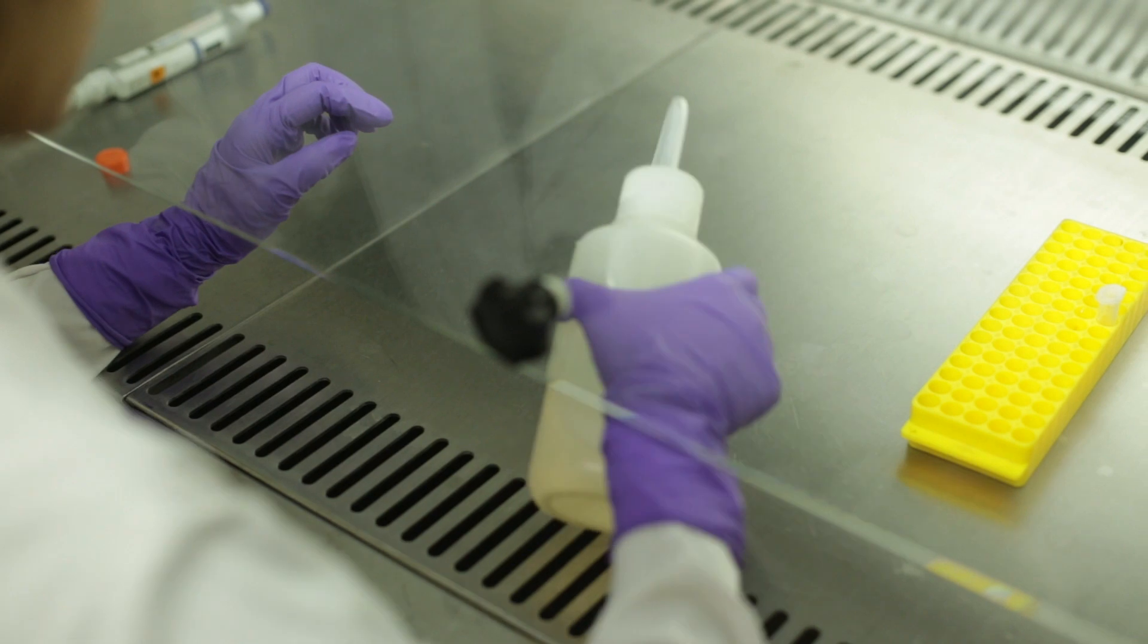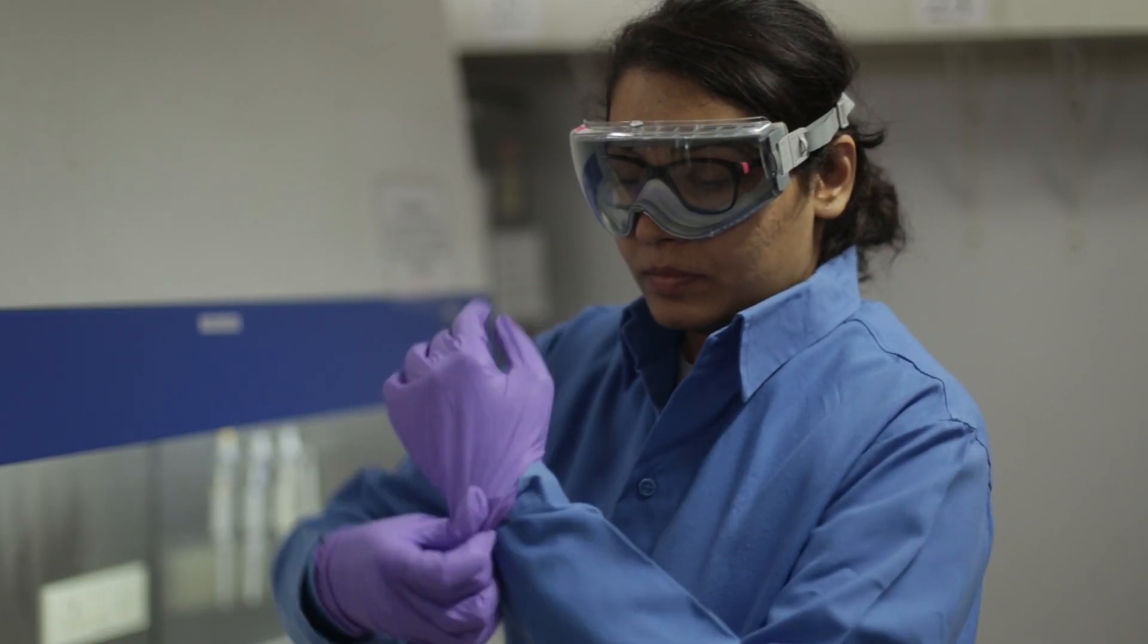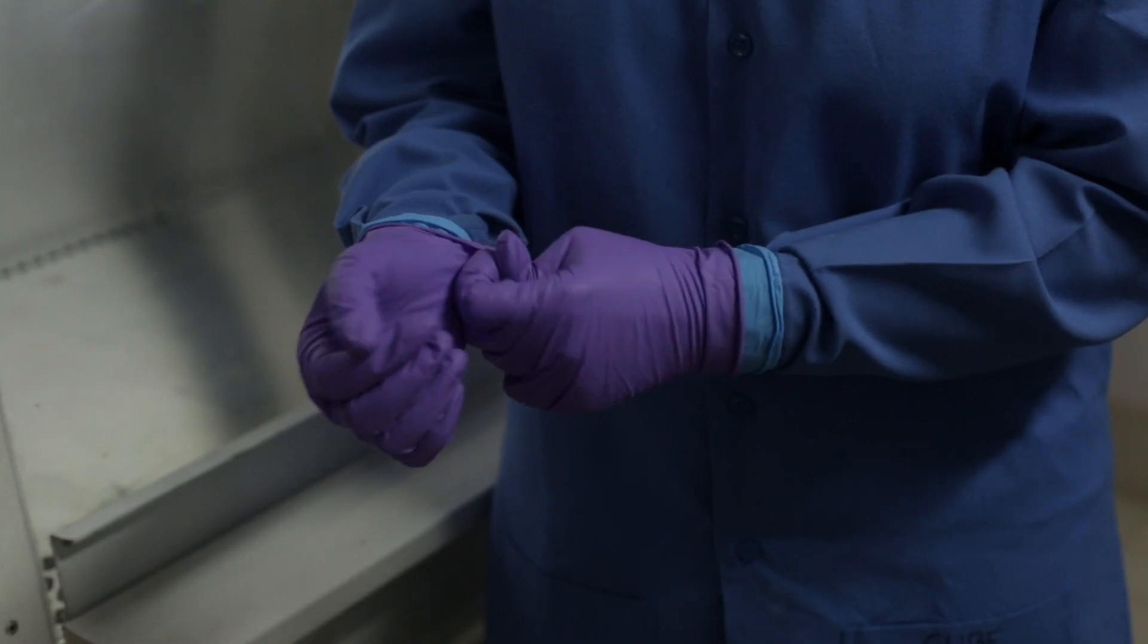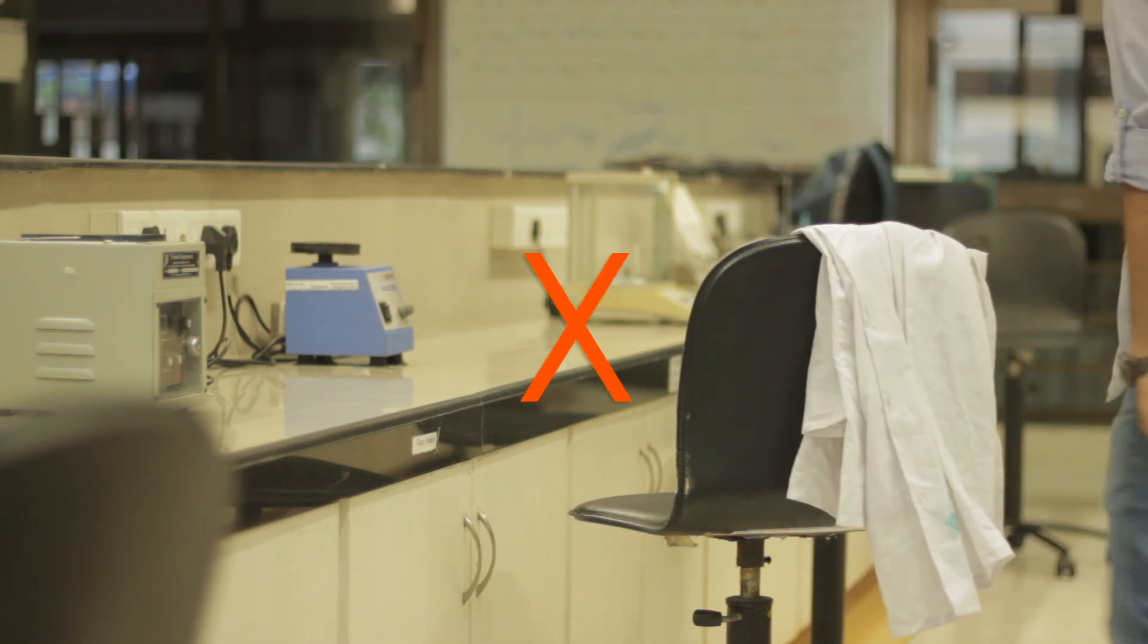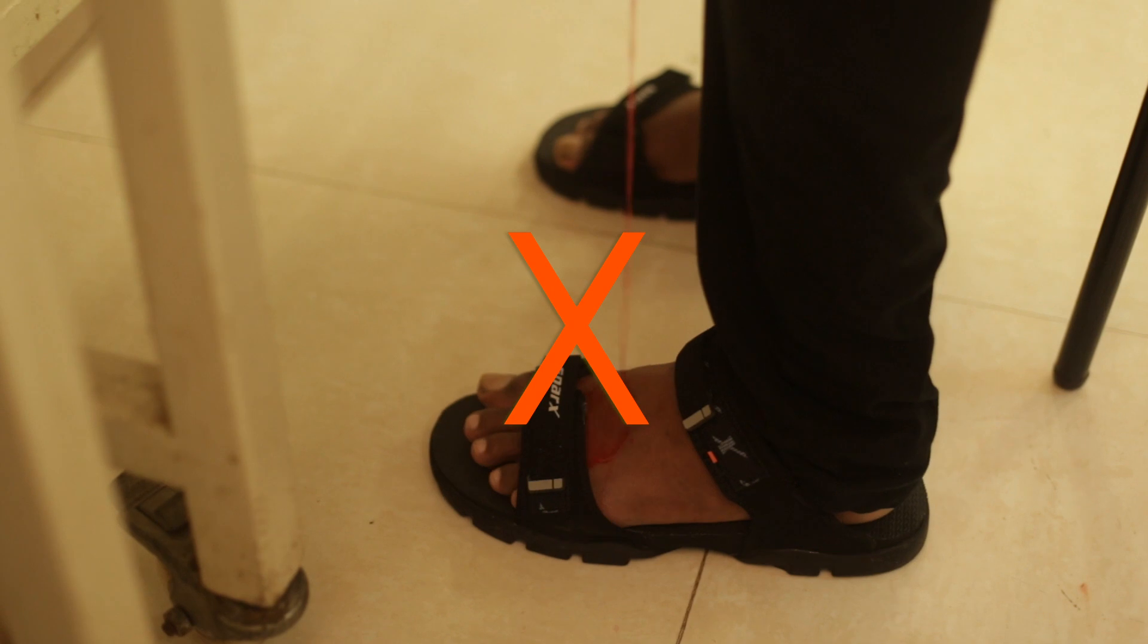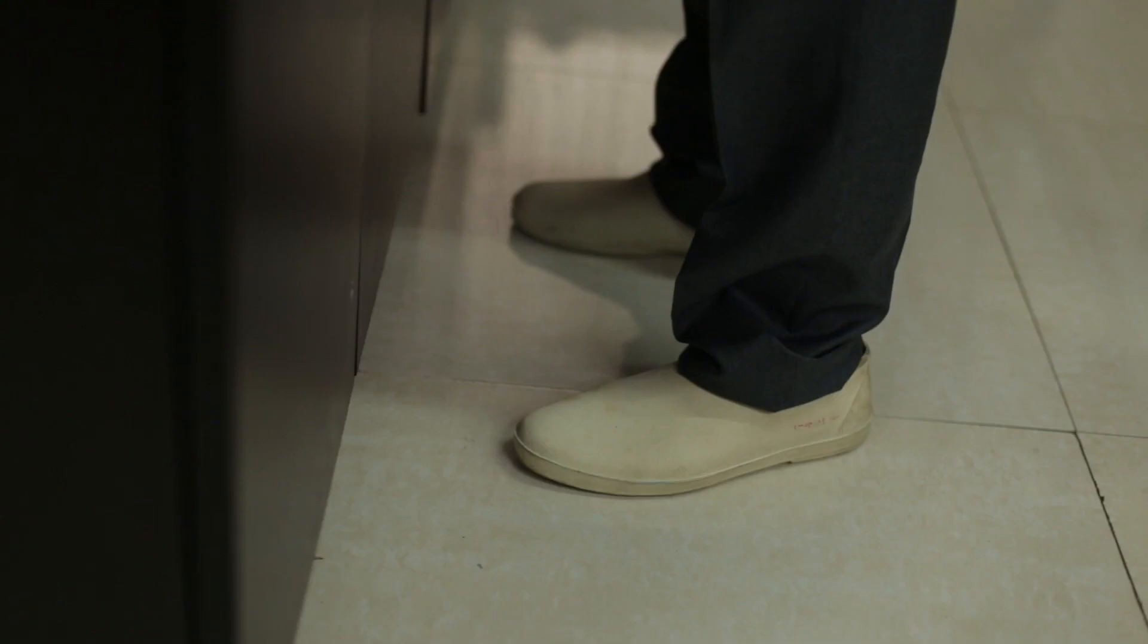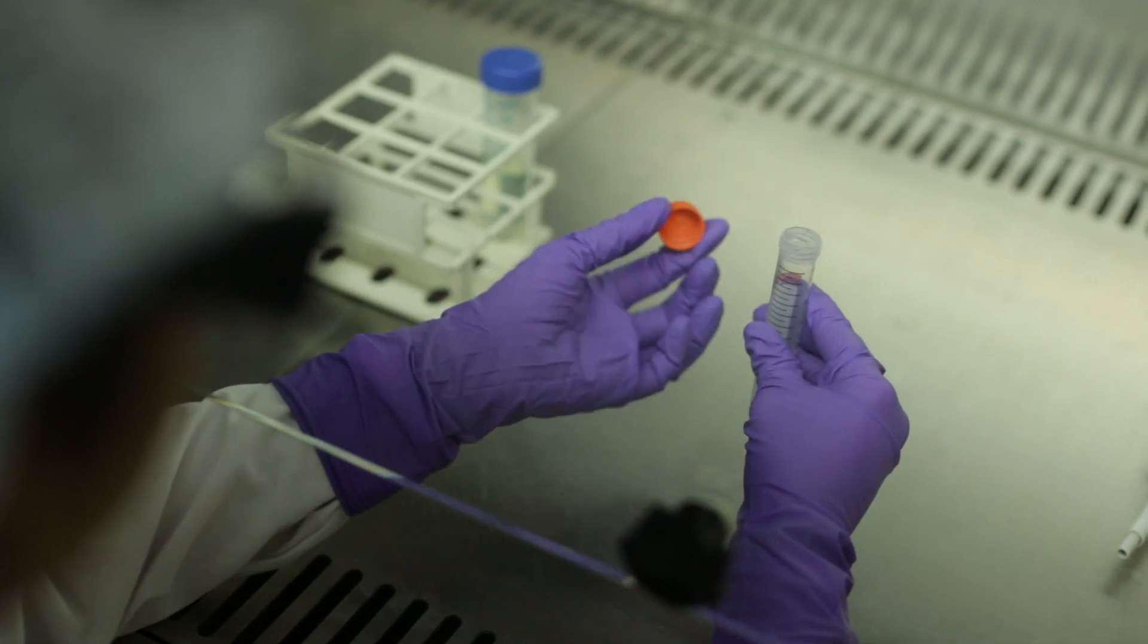Always wear personal protective equipment while working in the laboratory. Always use laboratory coats or gowns and double gloves where required. Do not place laboratory coats in common areas. Sandals must not be worn in the laboratory as this will not offer protection from any spills. Always use toe-covered footwear.